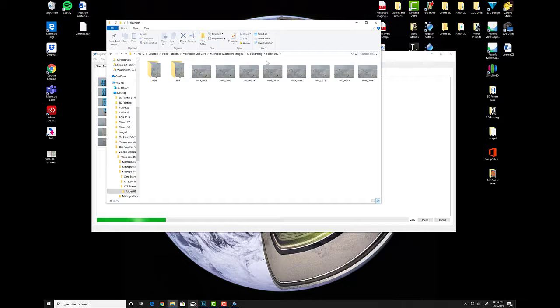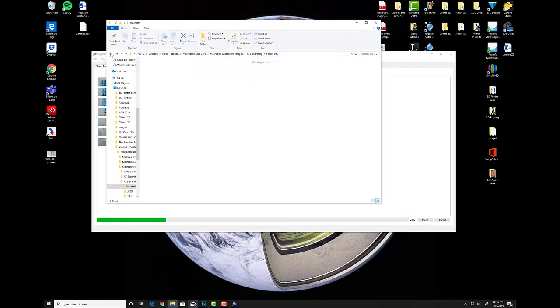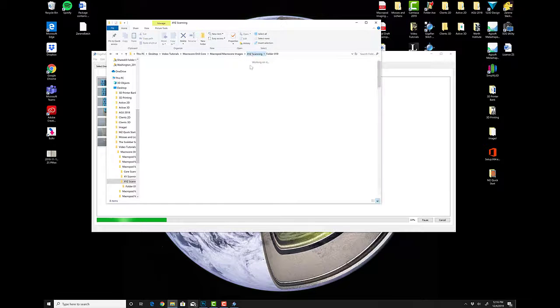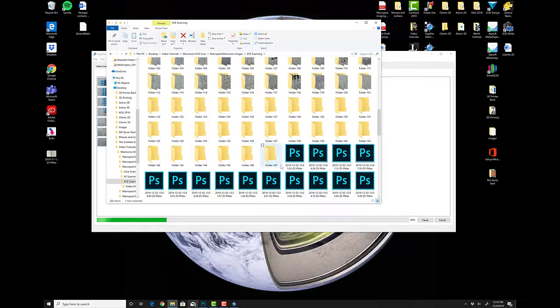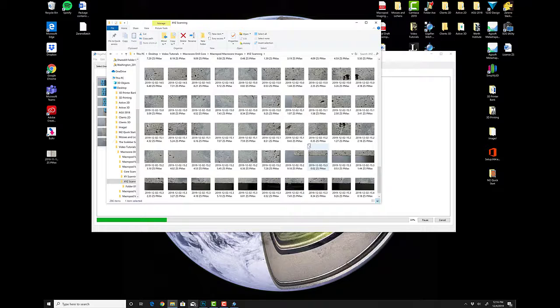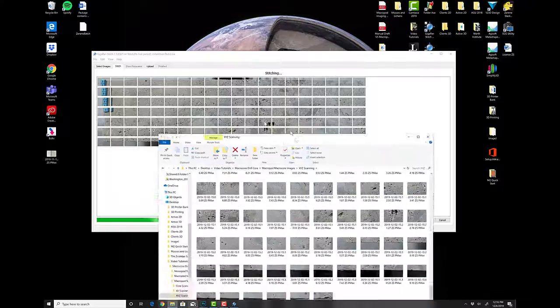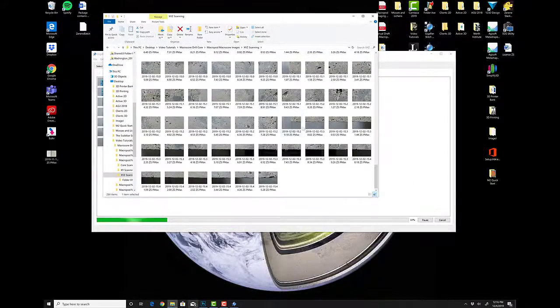It took these images. That's the one I accidentally selected. And it created a JPEG of smaller file sizes. And that's how that function basically works. So sorry about that. It was some slight confusion. We'll just delete those. But yeah, that's one way you can do it. It'll create a new folder. It'll make all these images smaller and much more manageable in order to process. But again, this software back here is going to do the trick.